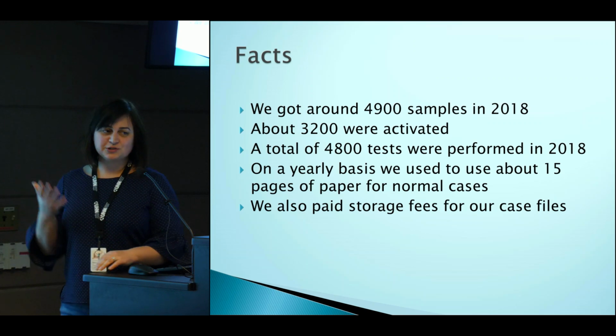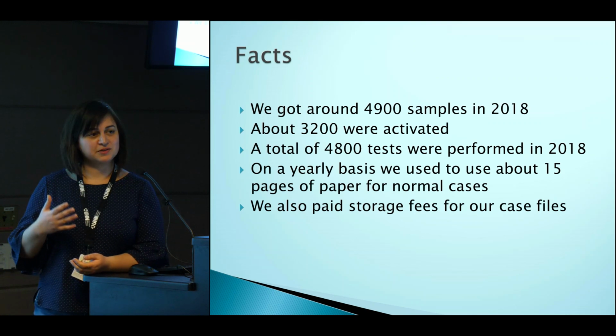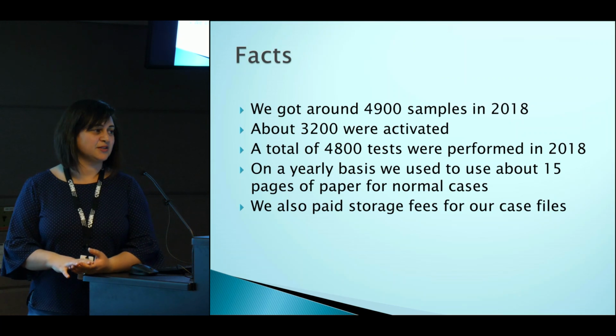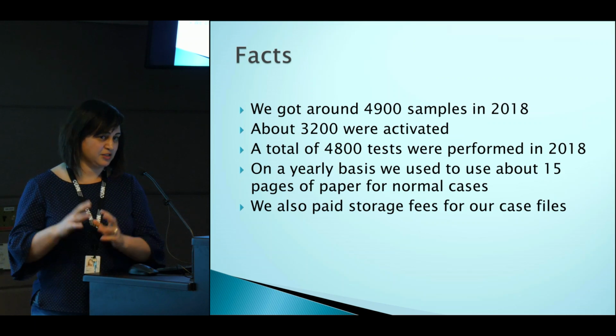Going digital, or using the software that we already had to its utmost, allowed us to not only reduce paper and go environmentally friendly, but also save a little bit of money, aside from allowing all the information for a specific patient to be available in one place in a secure fashion.